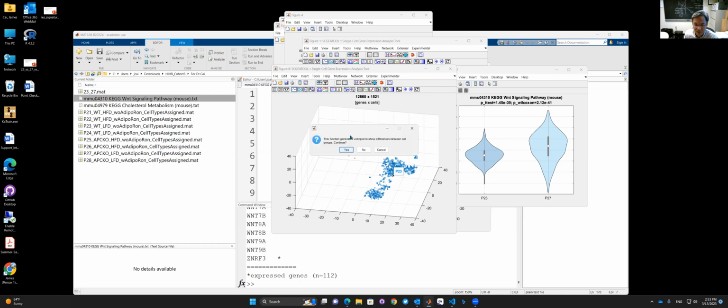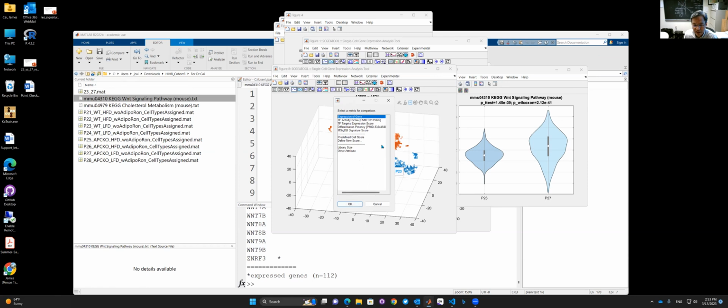There are other options you probably want to try later. So for example, you can try batch ID again, same. You can select this, like differential potency. We have used that before to measure stemness. You can also maybe try some of those signatures. Same idea. So you get the violin plot. You can look at which is high, which is low. Especially this one, it contains a lot of signatures, including, I believe, these two.